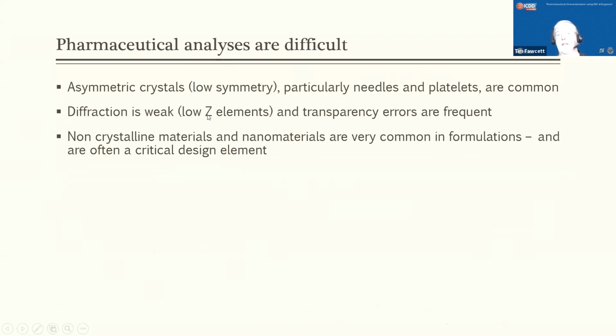What this means is the X-rays penetrate deep into the sample. And because they penetrate deep into the sample, you can get both transparency errors, where you get diffraction from different levels of your sample, and you get displacement errors. And these errors are frequent. Now, if you happen to work in inorganic materials or mineral analysis, geological materials, these types of things, you may bump into them 10% of the time. If you're working with a pharmaceutical, you're bumping into these two problems about 80% of the time.